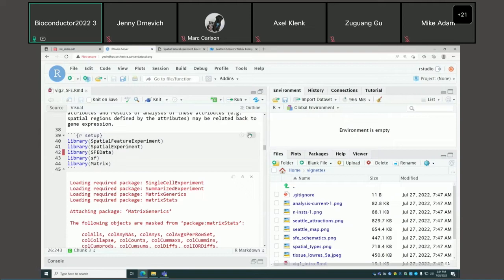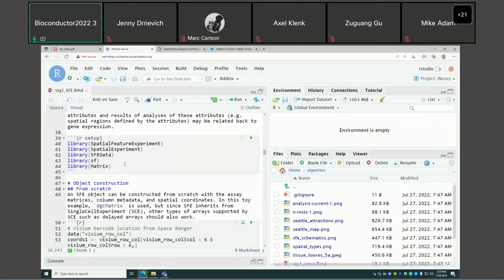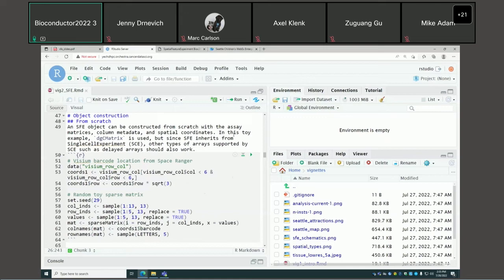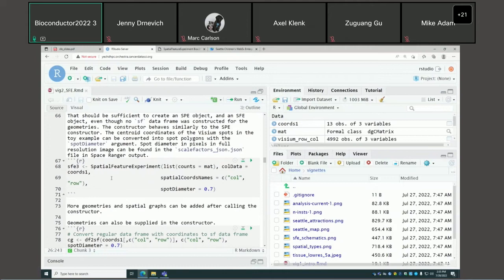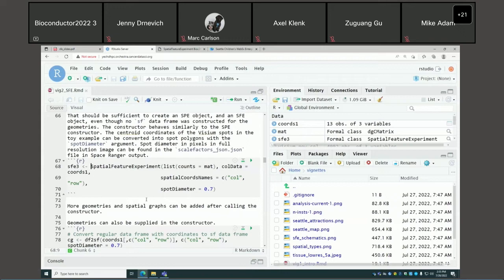The text explains what those fields are. Now we load the packages. The example data is from the SFEdata package. To construct an SFE object, we can do it from scratch from a sparse matrix and call the constructor, which behaves very similarly to the constructors of SingleCellExperiment and SpatialExperiment.